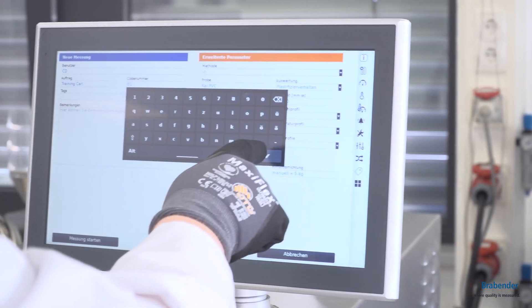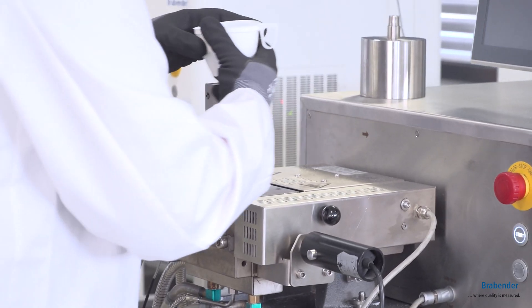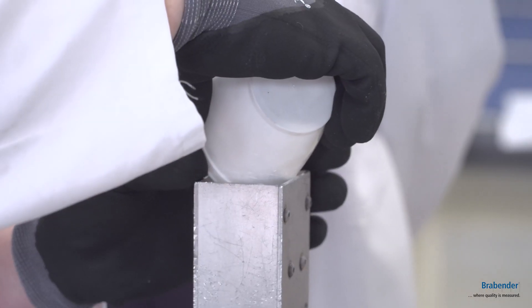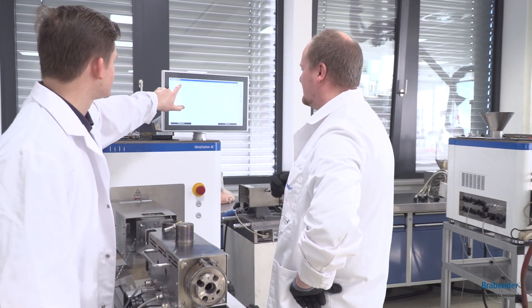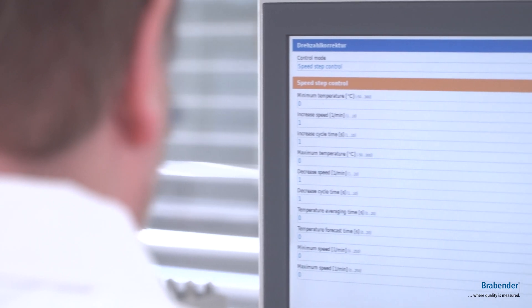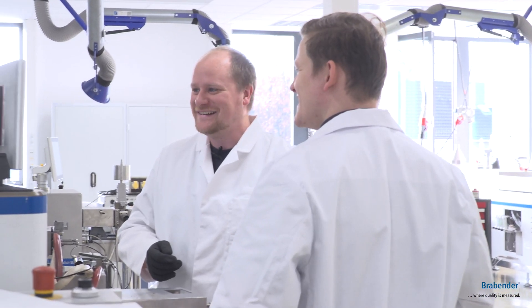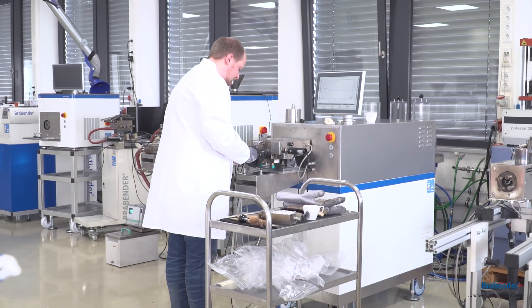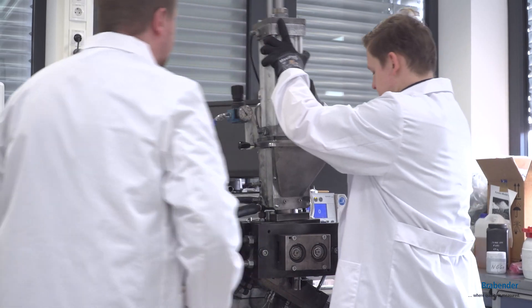In the beginning, we run some trials with the 4E and 8E metastation. Today we run some trials with PVC, where we can measure the mixing behavior of PVC and the fusion behavior of the PVC material.